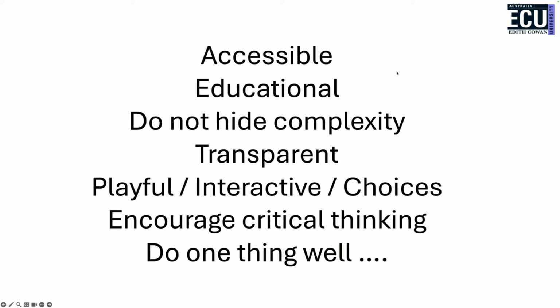Well, the first one would be to be accessible. I really want this to be something that particularly analytical chemists could use, where they may not be particularly interested or happy to load R libraries in or try and install R or Python or anything like that. I have tried to encourage people to become programmers, whatever their background. Some people take to it. Some people are just too busy. Some people just don't want to. So the easiest way for people to get on board with understanding the concepts was to provide something that was a standalone app, because that was the easiest thing to install.